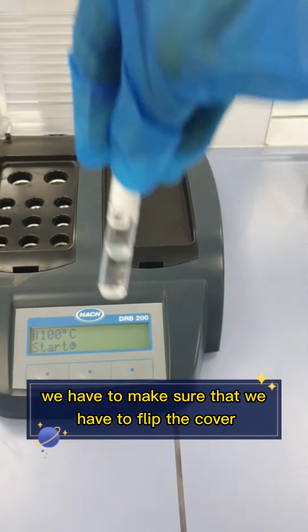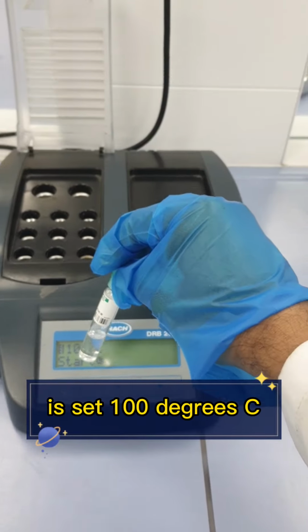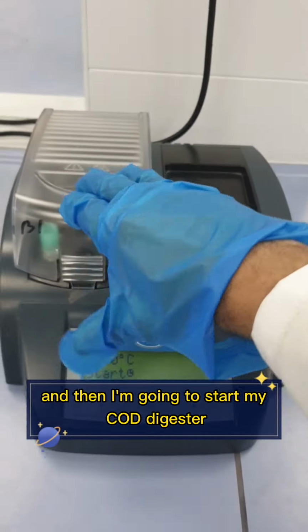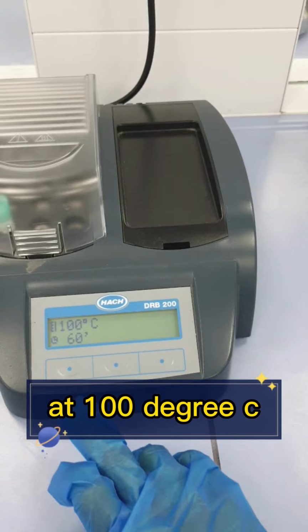This is our COD digester, which is already set at 100 degrees C. Before putting the samples, we have to make sure that this COD digester is set at 100 degrees C. So we have set it at 100 degrees C, and then I'm going to start my COD digester. Okay, so this will be running for 1 hour at 100 degrees C.